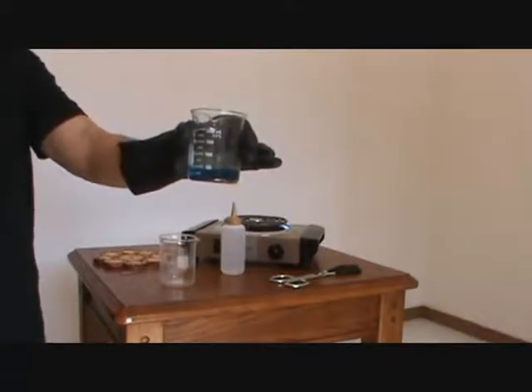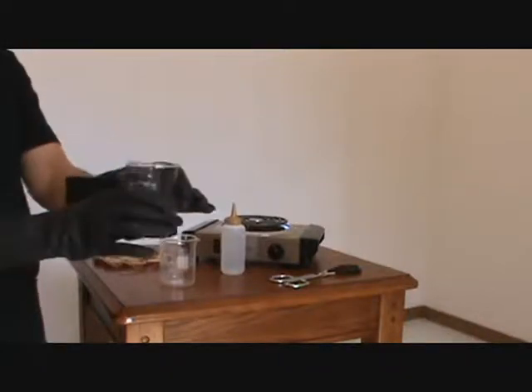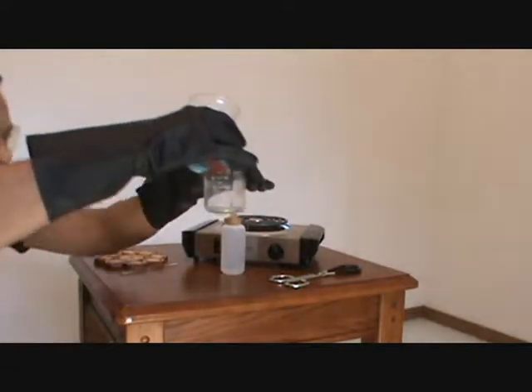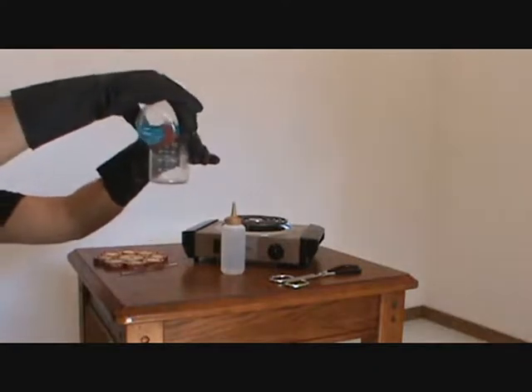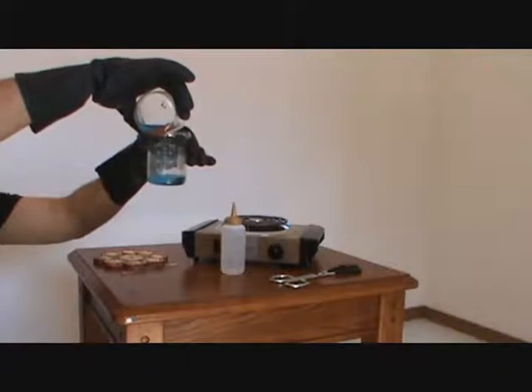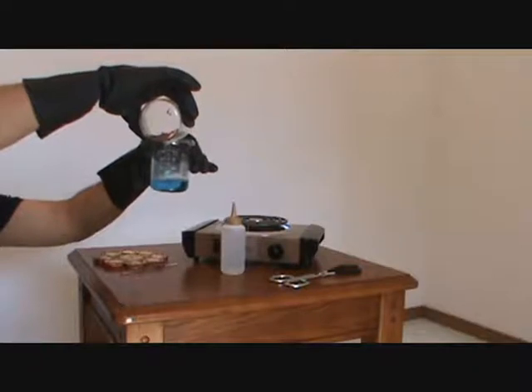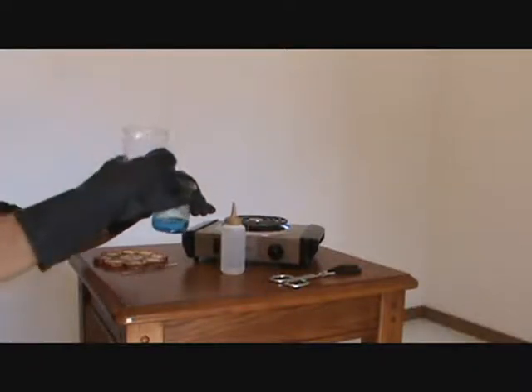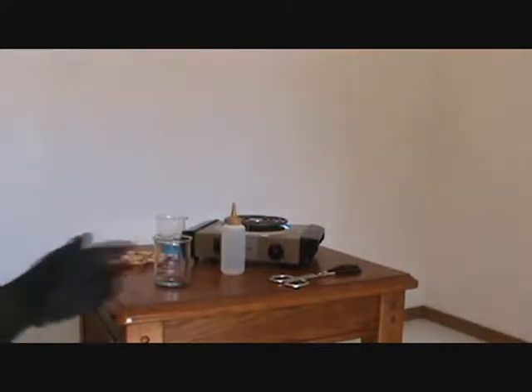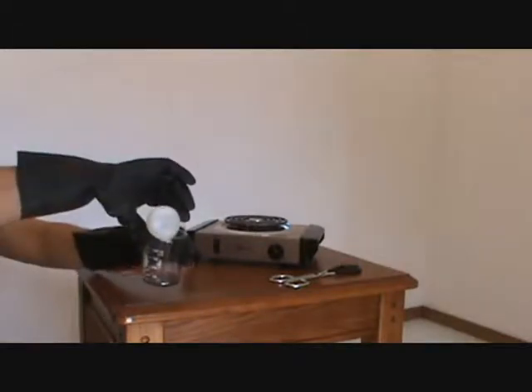I will carefully pour off only the liquid and not any of the solid into this beaker. I will now wash the sample using distilled water.